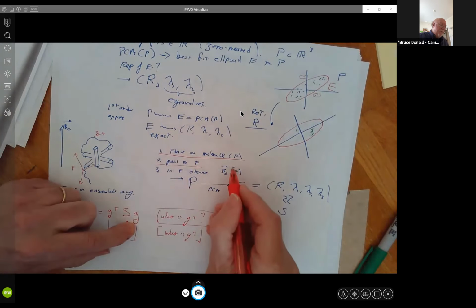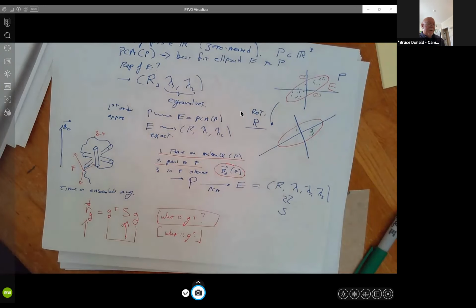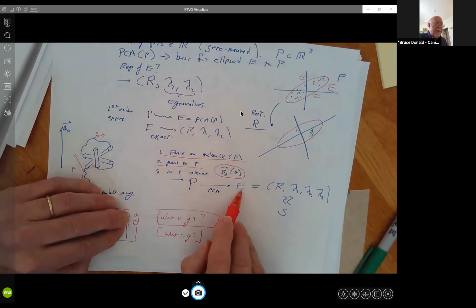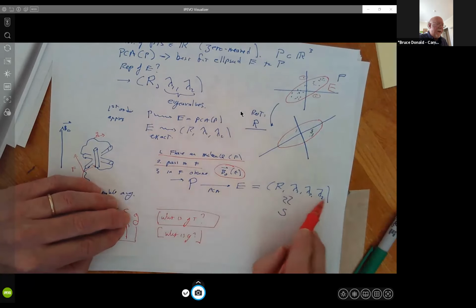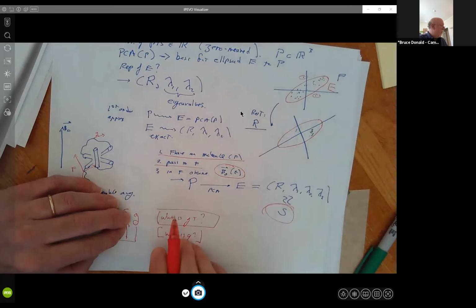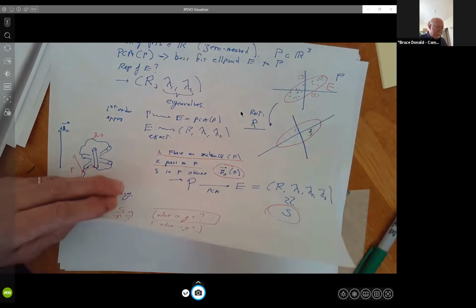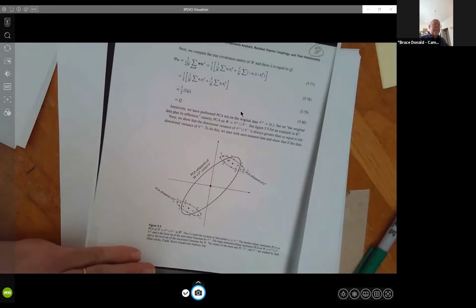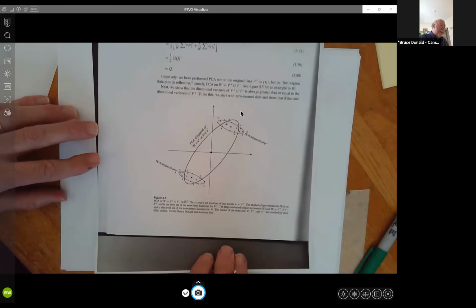In the molecular frame, the experiment observes essentially the cloud of points B0 as a function of time, although you don't see the time. All these different points are how the flagpole looks when you're riding on the horse that's bucking around. And then we just do PCA on that to fit an ellipsoid, represent the ellipsoid by a matrix and the eigenvalues, which is an approximation to the alignment tensor. That's pretty cool.